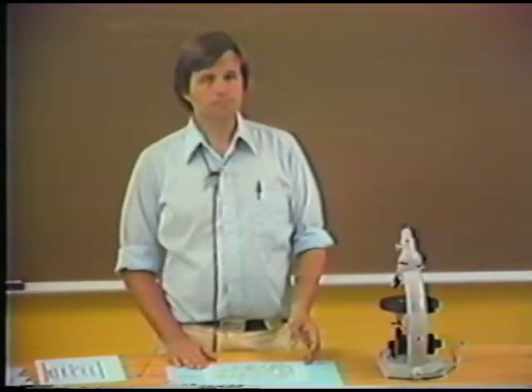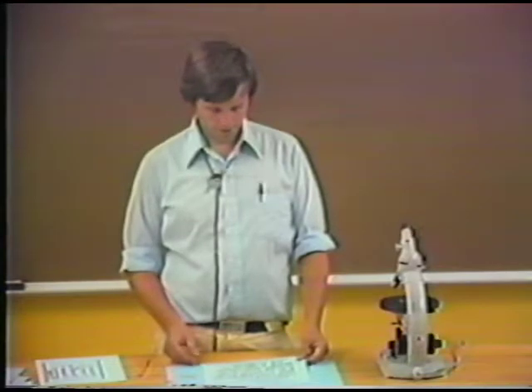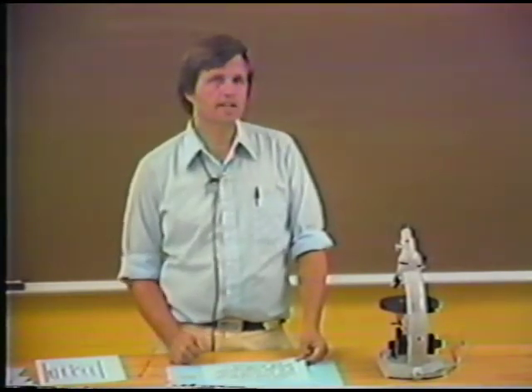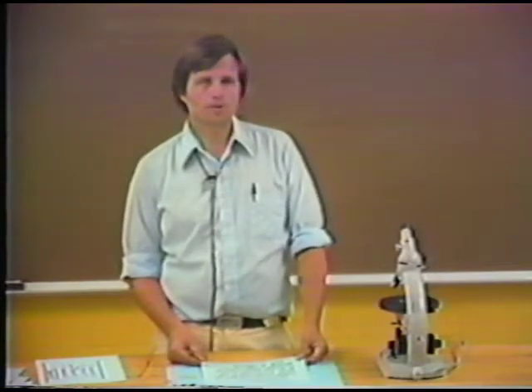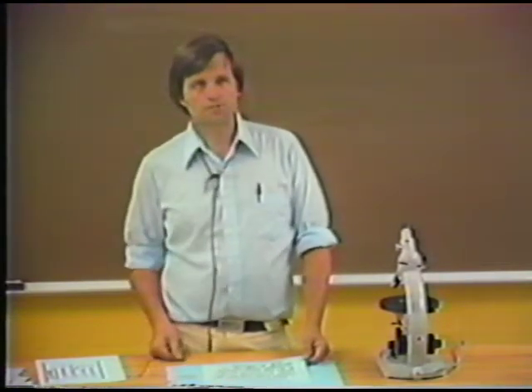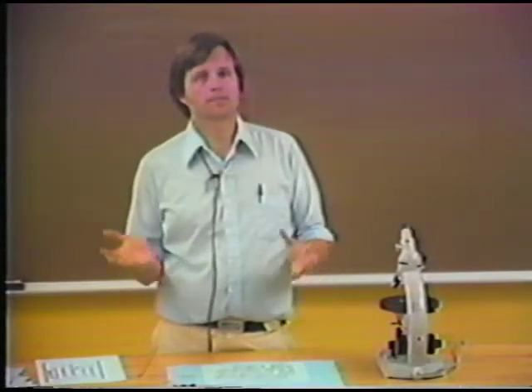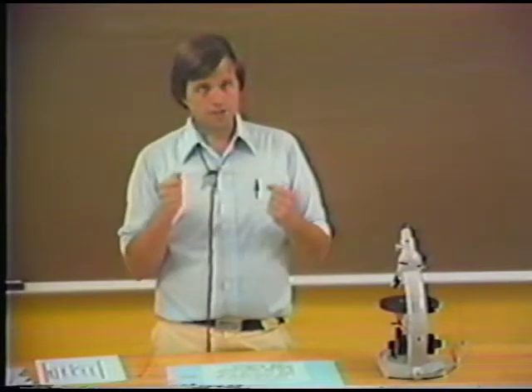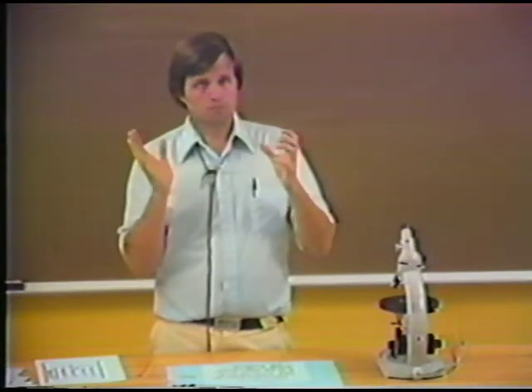Now, an easy way to make sure that the E ray is parallel to the polarizer is to watch extinction on the mineral grain. After you've seen the isogyres leave the field in the correct direction, then you want to look at the mineral grain in cross-polarized light.